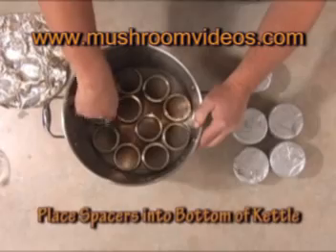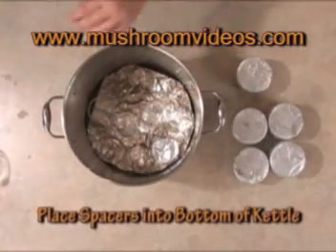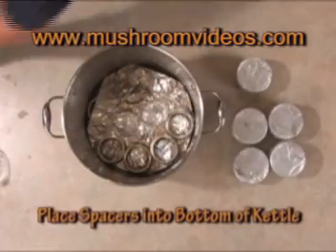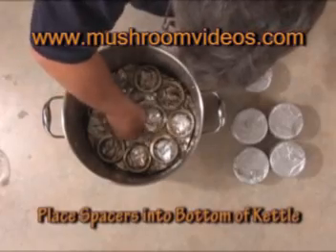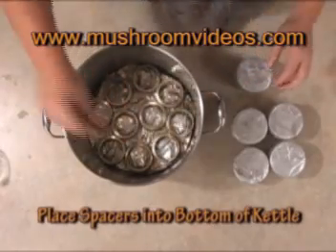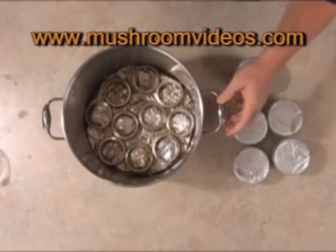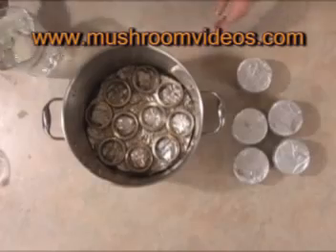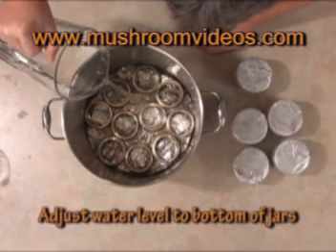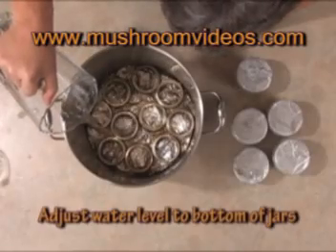Because sometimes if you put the jars on the bottom of your pot, it'll crack the bottoms or burn the substrate in the bottom of the jar from the intense heat. I'm going to put another layer of jar lids in, so the jars will be two or three centimeters off the bottom and out of the water. Now I'm going to put some water in — just enough so it comes up to the top jar ring. The important thing is the jars are completely out of the water.